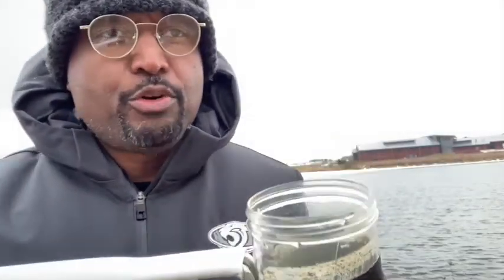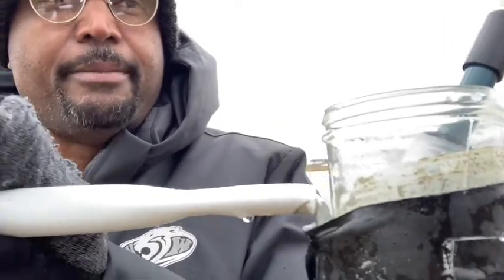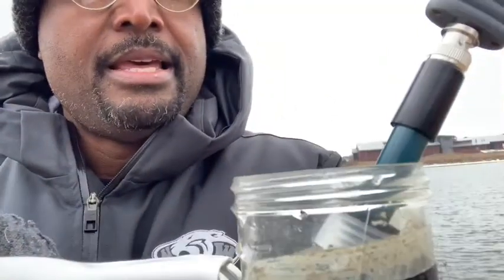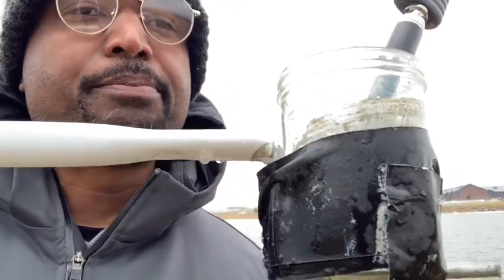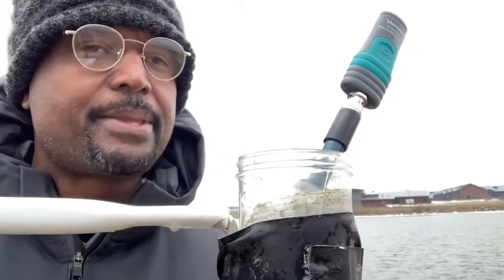My old-fashioned scooper to get some water out. Then I simply put my pH probe in my water, and since I'm using the same device to film as I'm going to be using for my pH, I'm going to pause and I'll come back and tell you what the pH is. As it turns out, the pH of my water was 6.76, which would indicate that it was slightly acidic.